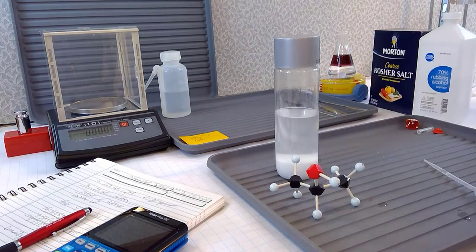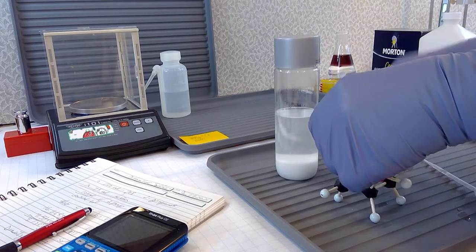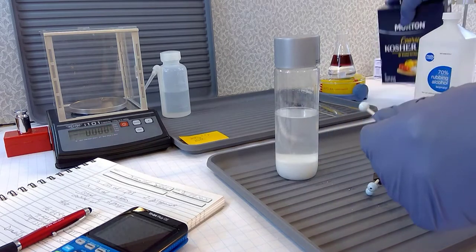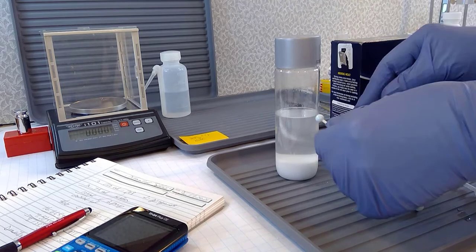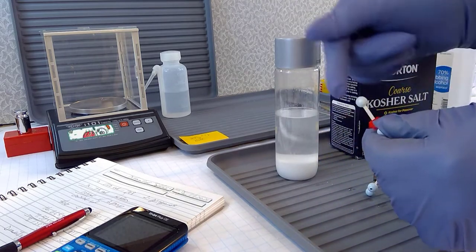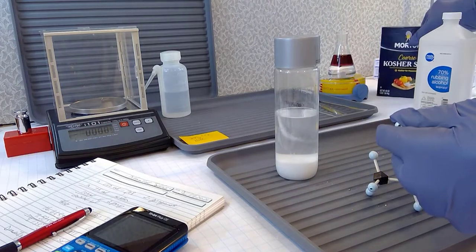We've got propanol in there that is attracted to the water molecules. But now we've got salt ions. We've got our Morton kosher salt ions in here, and they're pluses and minuses, and they're going to be attracted to the plus and minus of the water, the very intense plus and minus of the water.